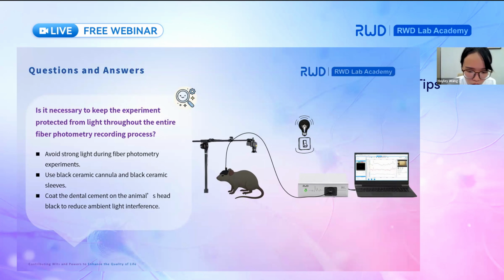We're currently using the R801, R21 tricolor fiber photometry system in our lab and have been satisfied with its performance. So far, GCaMP recording has been very robust and stable. I have a question regarding optimization and dual color recordings.